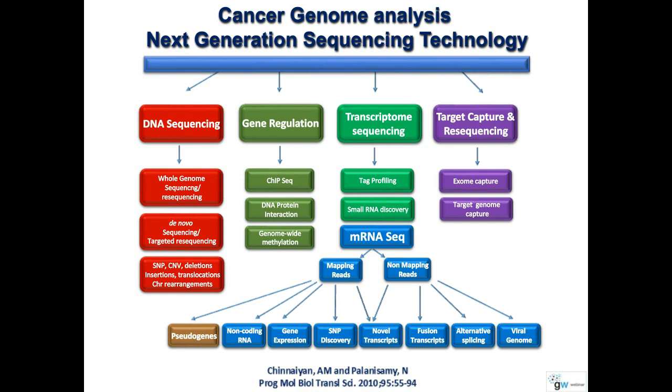As you see here, using next-generation sequencing technology, one can do several types of sequencing analysis, including whole genome sequencing or whole transcriptome sequencing, which we call RNA sequencing, and recently the most popular target capture and whole exome sequencing type of analysis.